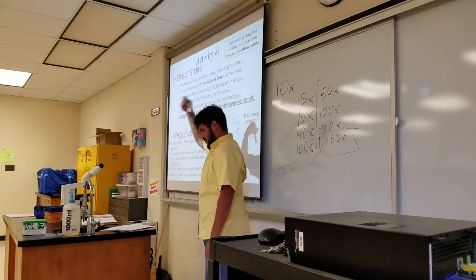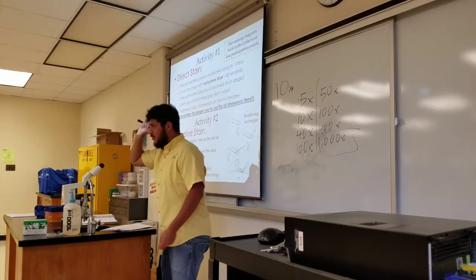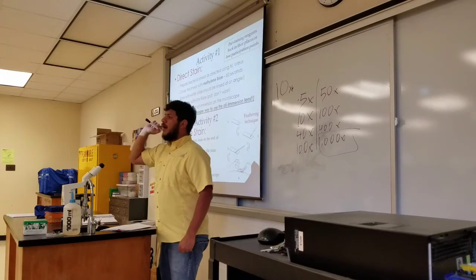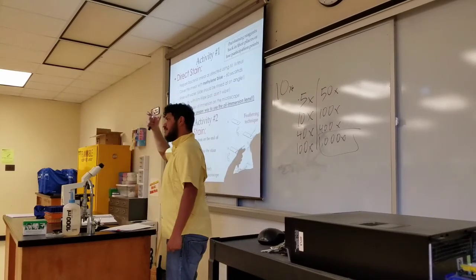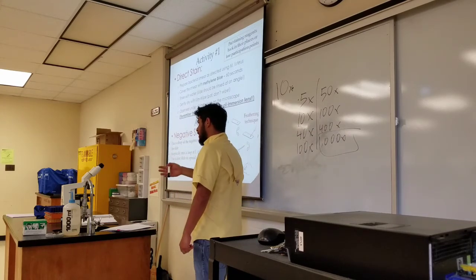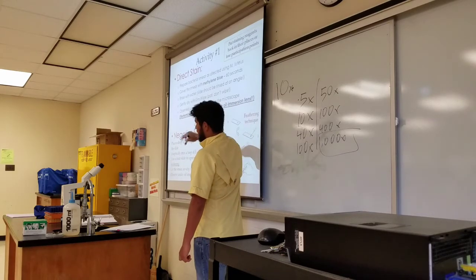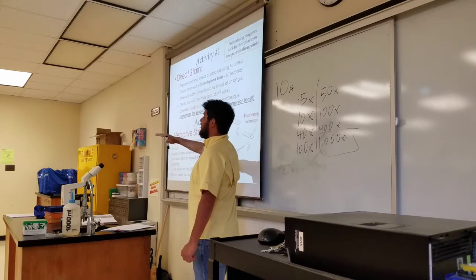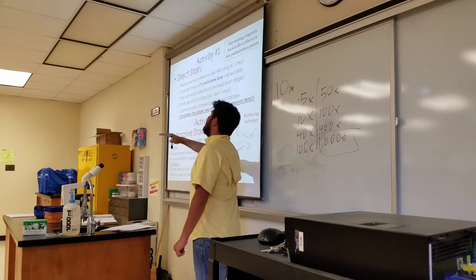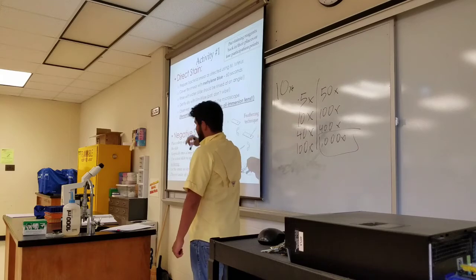We're going to put a very small drop of water, using the droppers on top of your bench, not the squishy bottle, because the squishy bottles put too much water, and then you're going to let it air dry. Up to there, we stop at step 1 of activity 1, and then continue to activity 2.